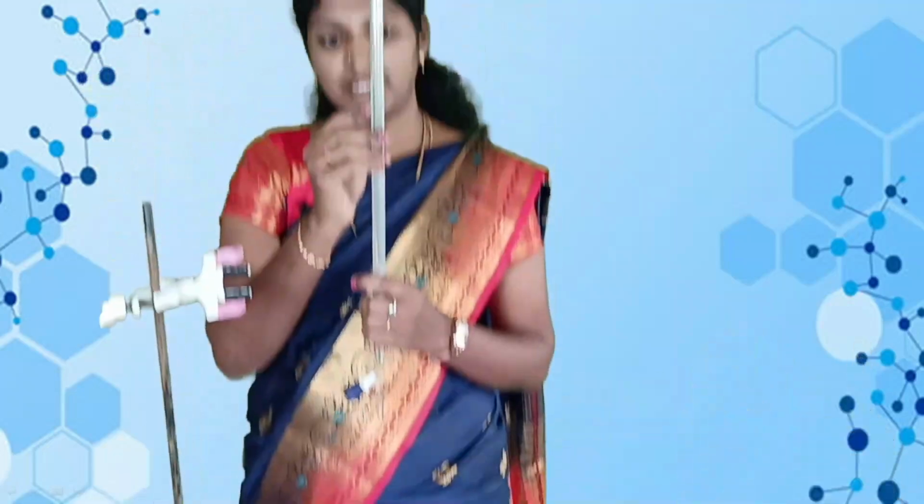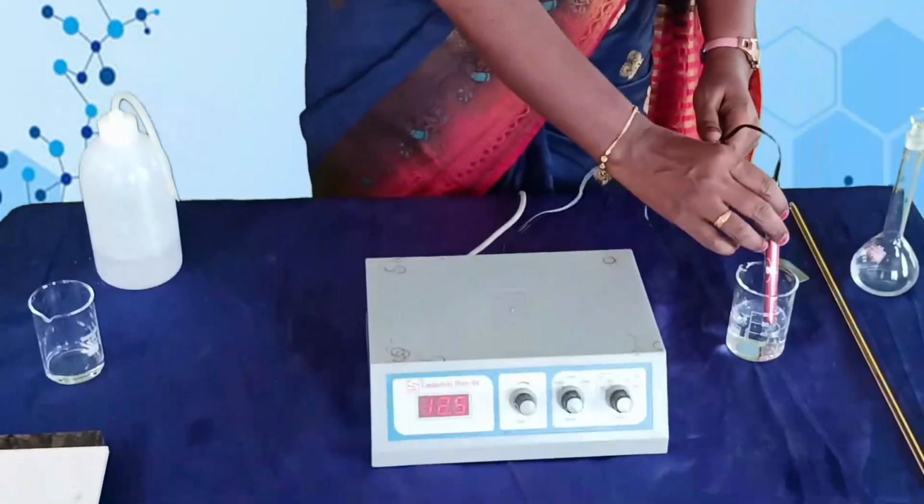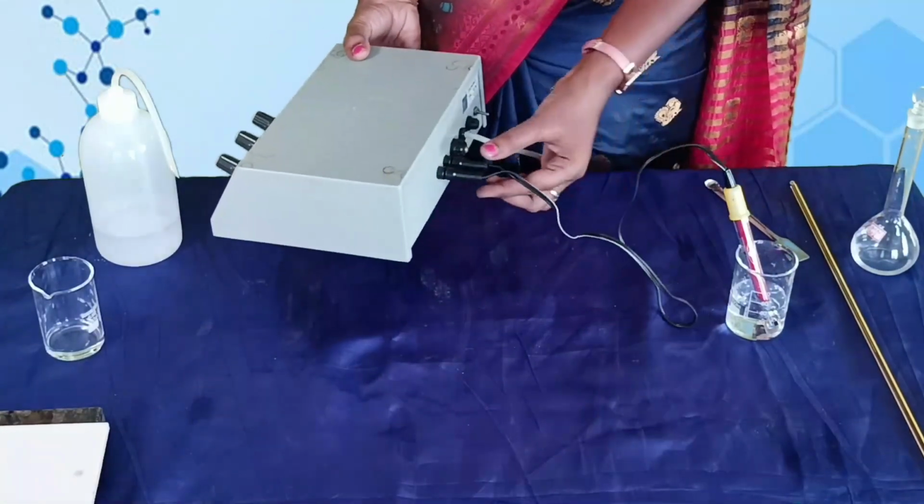Again it is 20.7. So 20.7 is the concordant value. Before starting the actual experiment, let us calibrate the instrument, for which about 40 ml of 0.1 normal KCl is taken in a 100 ml beaker and the conductivity cell is placed in it. And the conductivity cell is connected to the conductivity bridge.